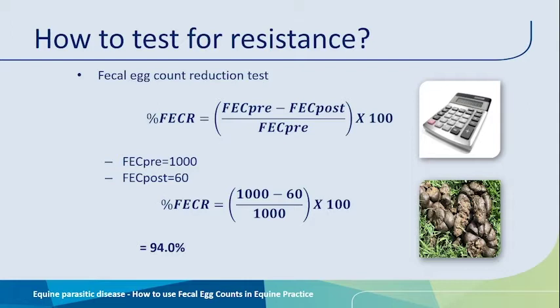The pragmatic fecal egg count reduction test, which might be a little bit simpler and yet still useful, is to at least run the post-treatment samples, even without knowing what the pre-treatment egg count levels were. We are not expecting positive egg counts 2 weeks post-treatment. And if we do get positive egg counts, we know that there's something wrong, and it could be resistance, it could be failure of administration or other, but there's certainly an opportunity to go back and revisit the routines and perhaps set up a real test to reevaluate.